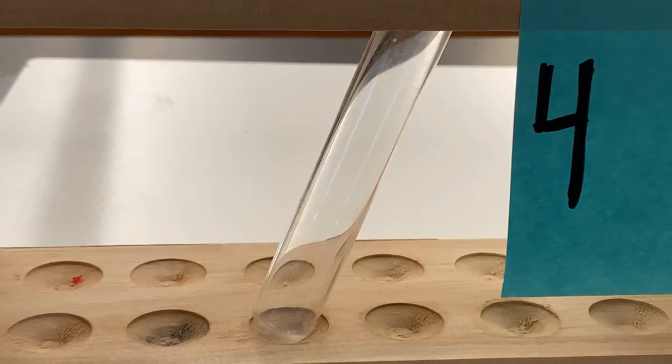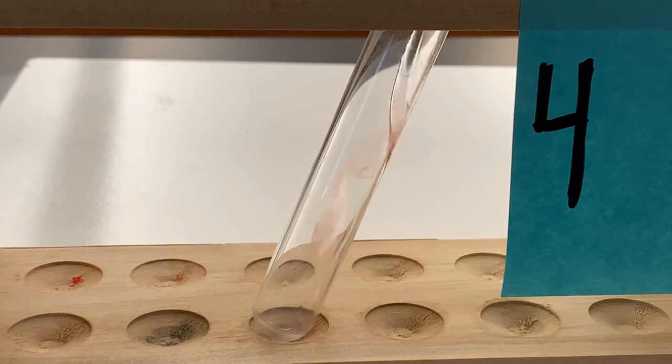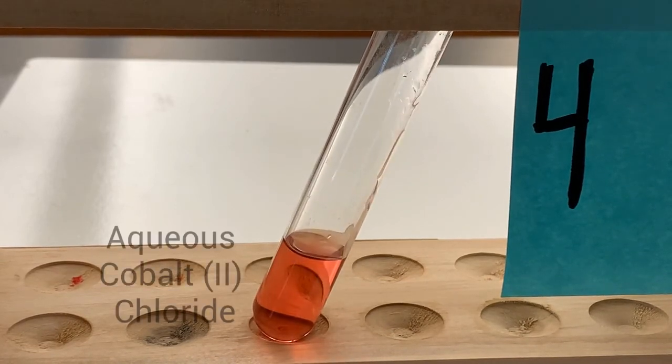In test tube 4, I'm going to add cobalt chloride, fresh sample, and then I'm going to very gently try to layer some acetone on top.